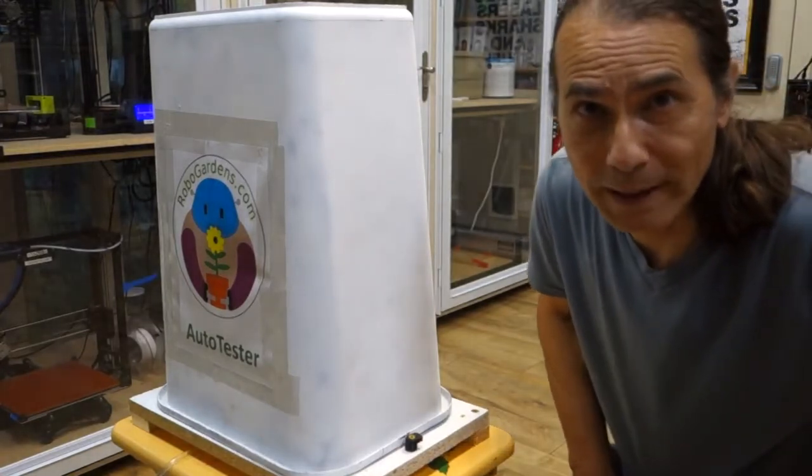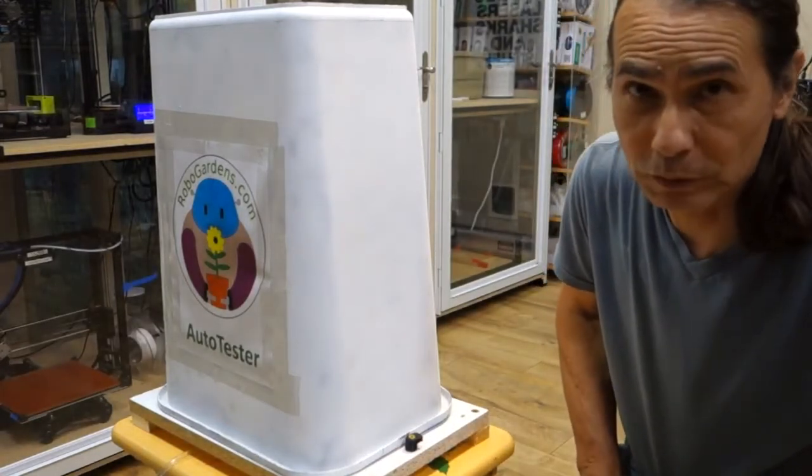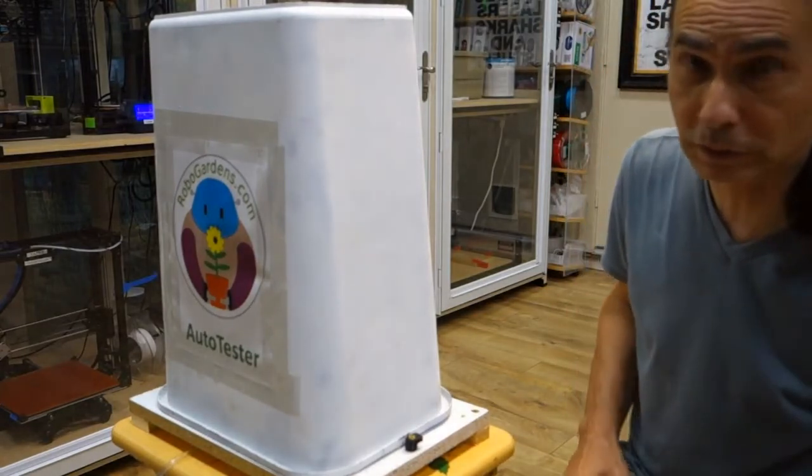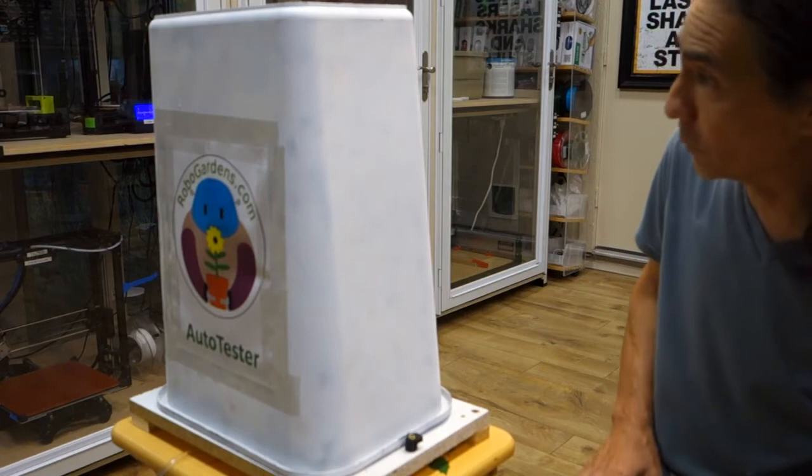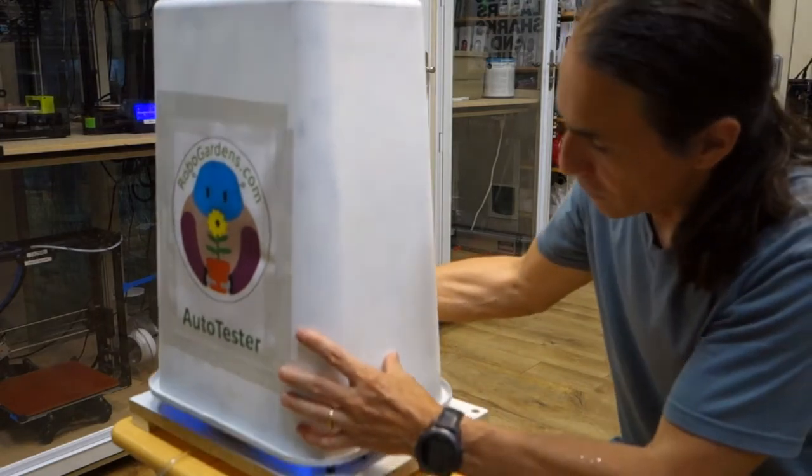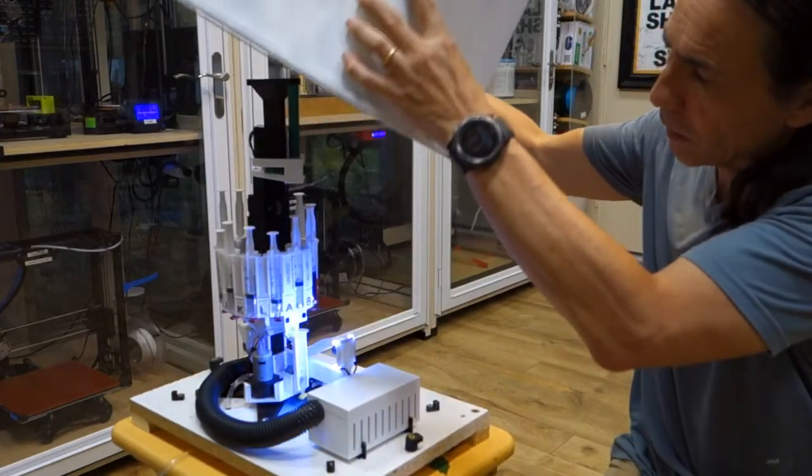Welcome to the Robo Gardens Lab. Let me show you what we have here. First I need to take off the cover which looks suspiciously like a painted trash can. And then you can see the auto tester.